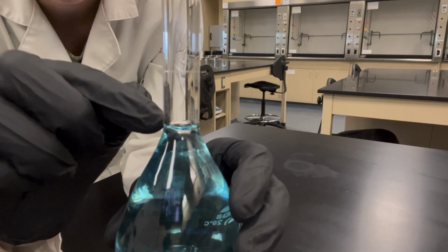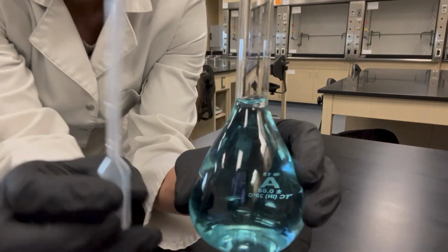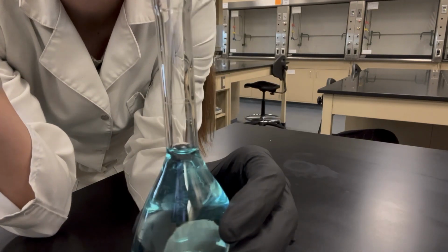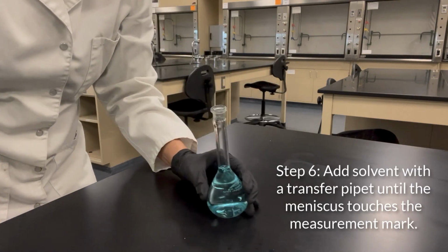So while we're still a couple centimeters below, I'm going to stop filling with my large source of the solvent, and I'm going to take a transfer pipette and I'm going to drop by drop add it into this volumetric flask until the meniscus is resting right on that measurement mark.